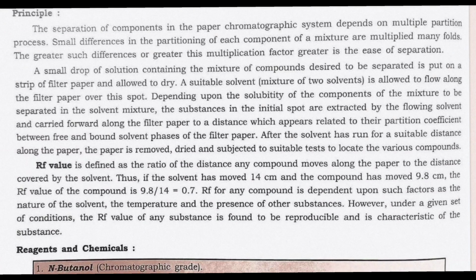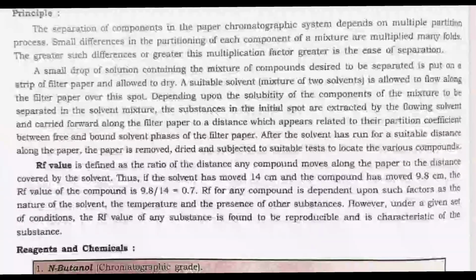RF for any compound is dependent upon such factors as the nature of the solvent, the temperature and the presence of other substances. However, under a given set of conditions, the RF value of any substance is found to be reproducible and is characteristic of the substance.